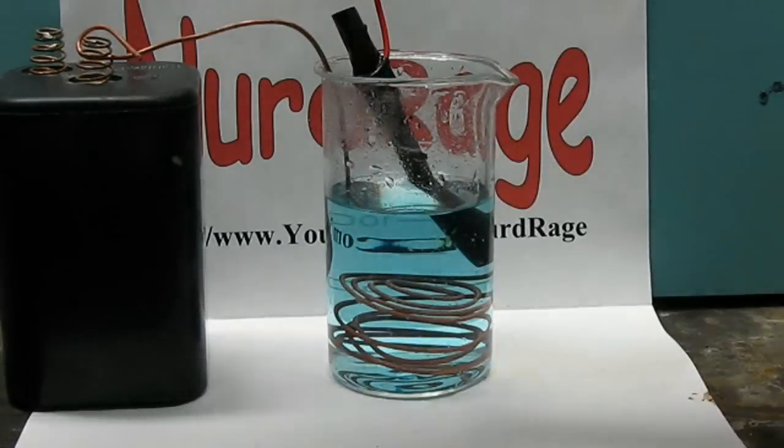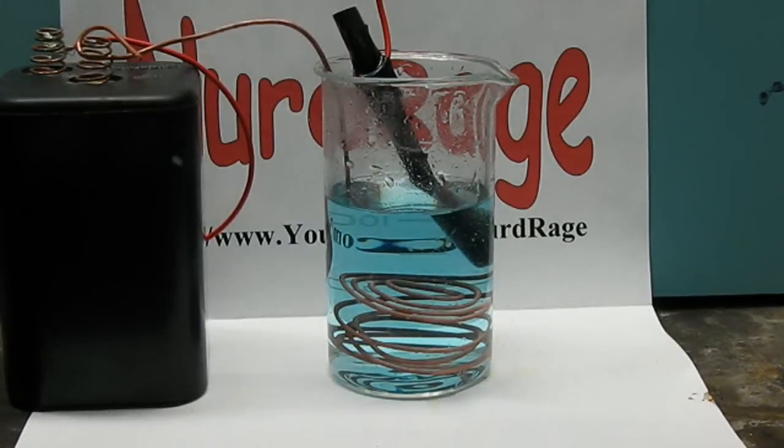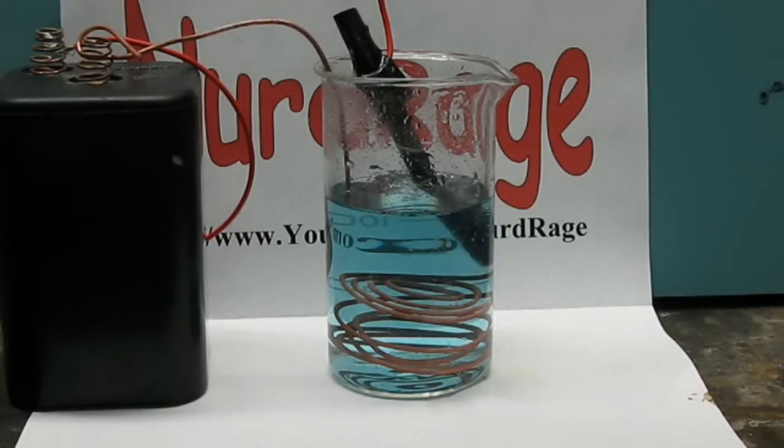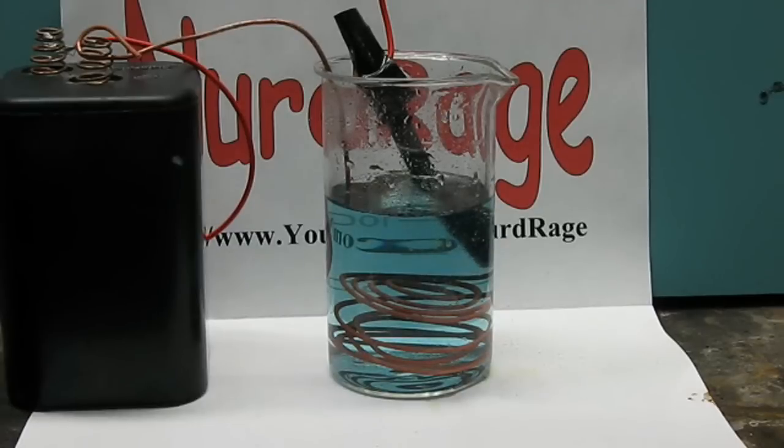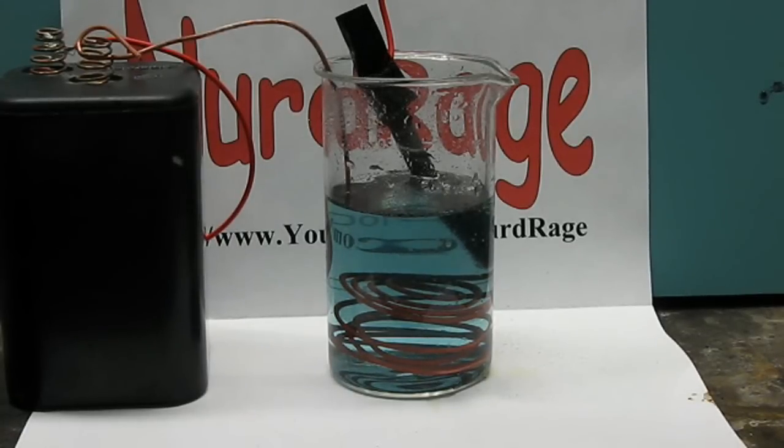Attach the carbon electrode to the positive terminal and suspend it above the copper electrode. The electric current causes the copper ions to deposit out as copper metal at the copper electrode. The water is split at the carbon electrode, liberating oxygen that bubbles out. The leftover hydrogen ions combine with the leftover sulfate to form sulfuric acid.